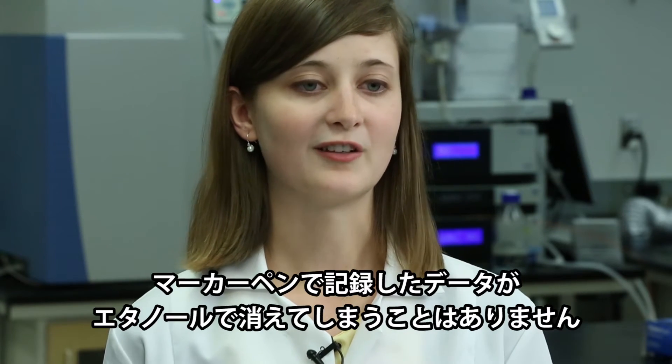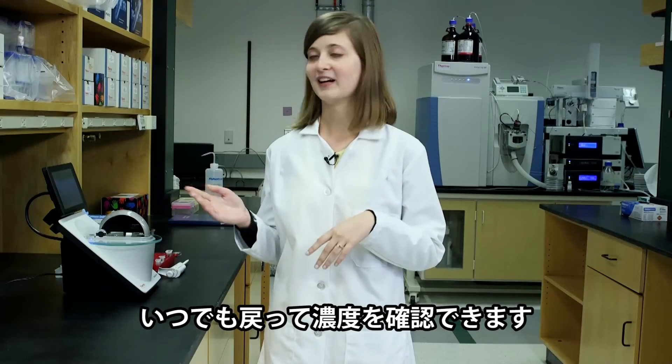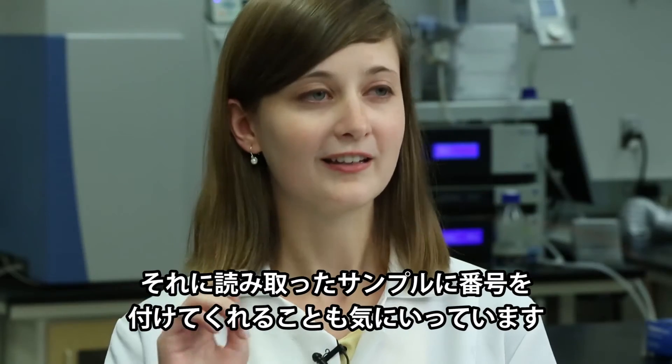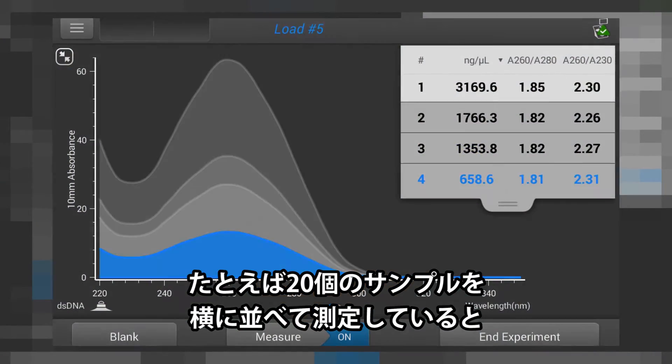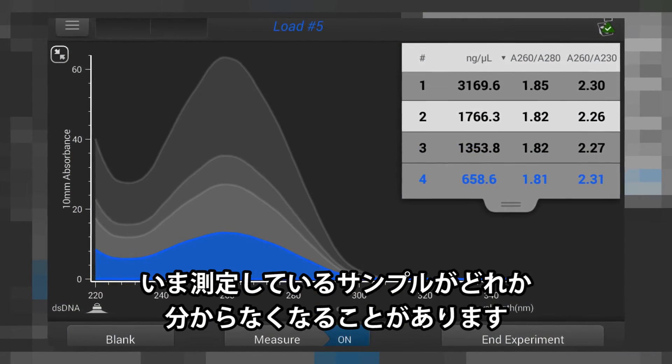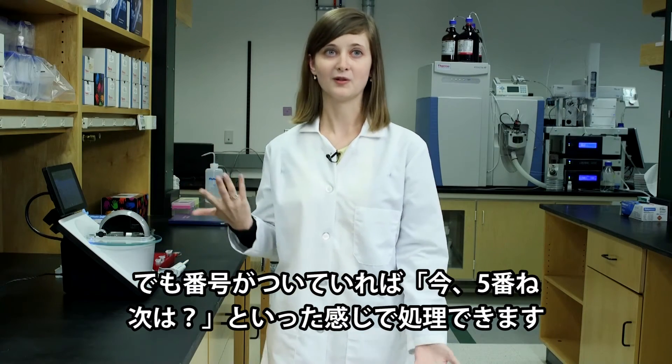So if you forgot to write things down, or if you wrote it in marker that can be erased with ethanol, you can go back and see what your concentrations were. And I like that it numbers which samples you read, because if you have 20 all lined up in a row, you can lose track of which one you were reading. So if you just look and say, oh, number five's up, you know what's next.